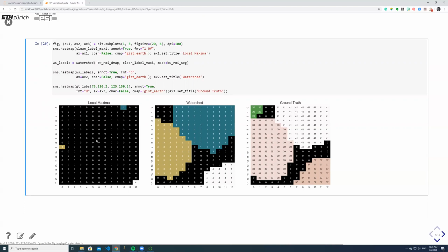I don't know if it was last week or the week before, I got the question if we can decide what the label is on the elements. And with this approach here, we can actually give whatever labels we want. If we start with renaming these seed points, then the labels of the regions will get that label number. So this is a way to make a choice on how they are labeled.